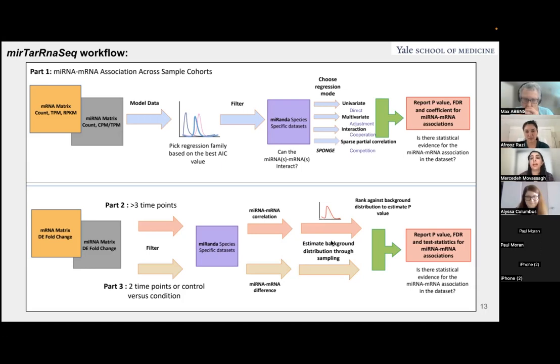You could use any type of tissue. It's a very good question, actually. So for Miranda, basically, the base of whether this prediction can occur or not is in 6 different types of species. And this is all the transcripts, all the microRNA transcripts that are available for everyone to use. The 6 common species are human, mice, CMV, EBV, I think I have macaque in there as well, and one other one, KSHV, that is already pre-run.